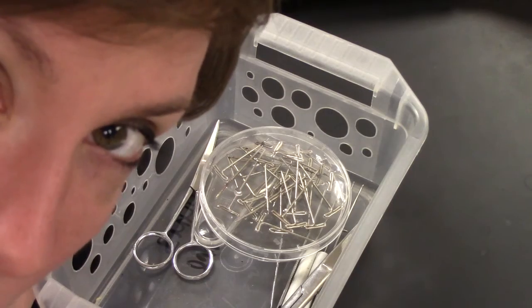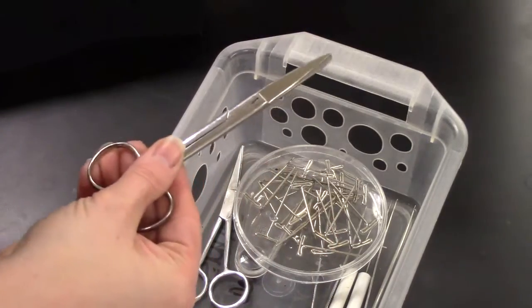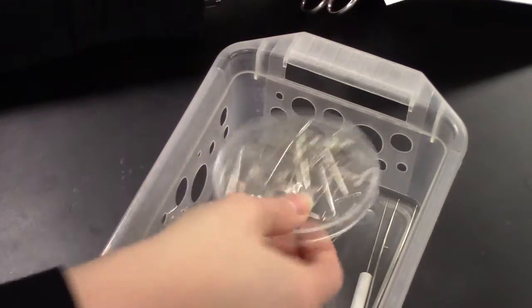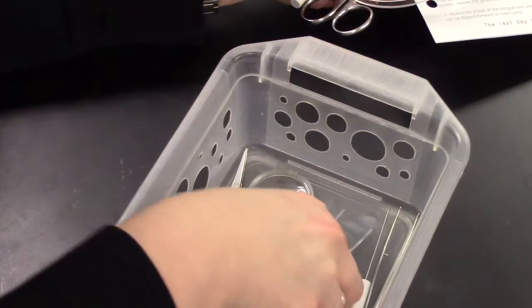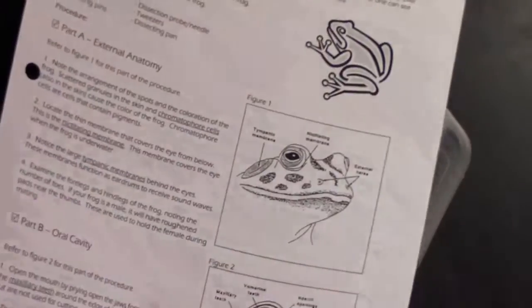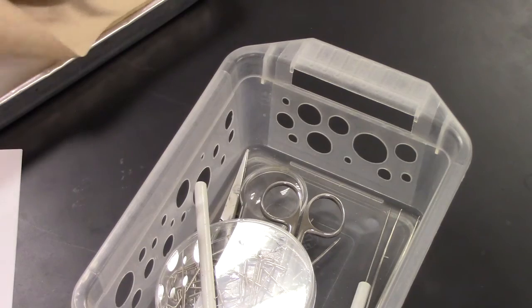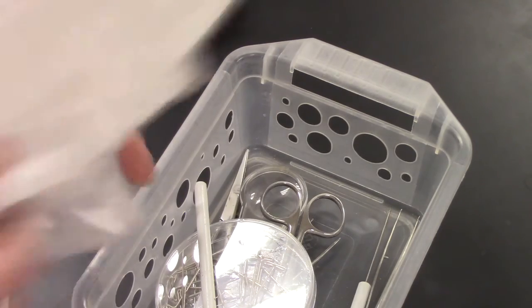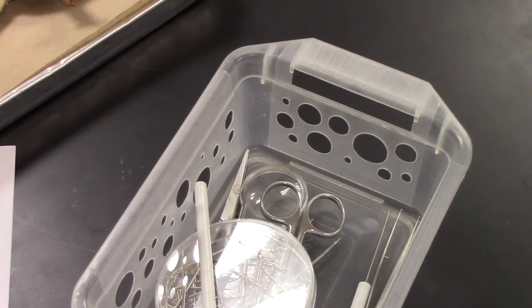A couple of things before we get started as far as what you need. Obviously you need some tools. In your tool basket you should have scissors, some t-pins — remember they're called t-pins because the end looks like a T — a dissecting needle or probe, and some tweezers. You should also have your lab. In your dissecting pan, remember to have paper towel in the bottom, and for cleanup we'll have a plastic bag and a fresh sheet of paper towel to put back in the tray.